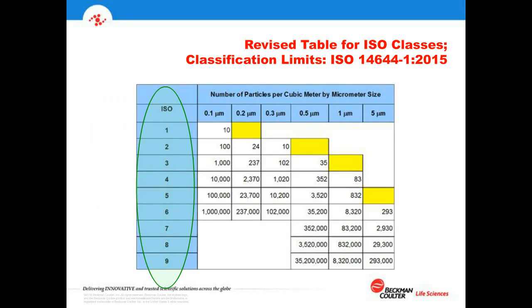So again, the limits for the ISO changed, as we'll see, and the general classifications are still the same. That's the same. The basic need here for the sizes, no change with that. What we do see, though, are a couple of changes in the outlying points of the table where we had very small numbers statistically and ran into issues in terms of the successful sampling of those, and using a statistical limit based on an extremely small number.